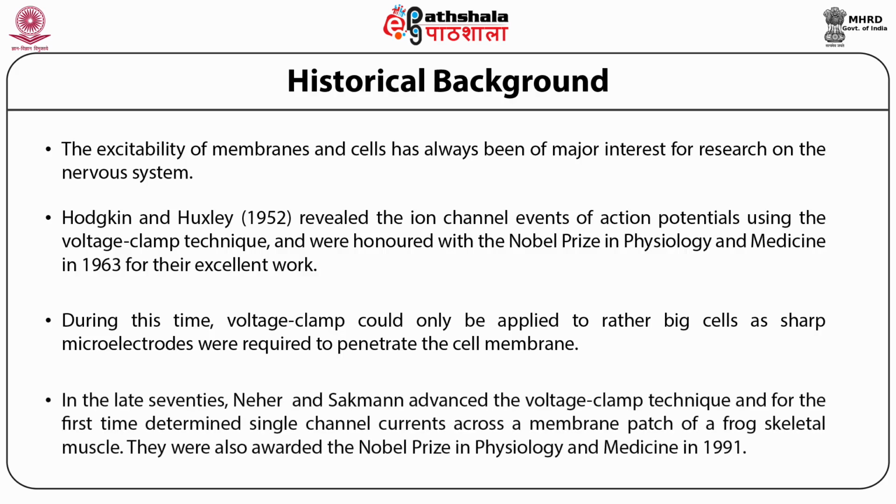In the later 70s, Neher and Sakmann advanced the voltage clamp technique and for the first time determined single channel currents across a membrane patch of a frog skeletal muscle. They were also awarded the Nobel Prize in Physiology and Medicine in 1991.